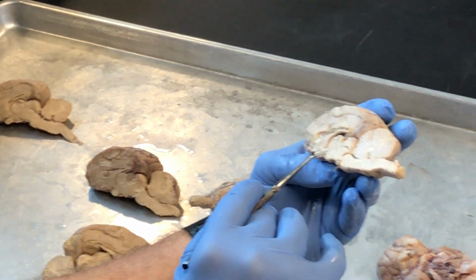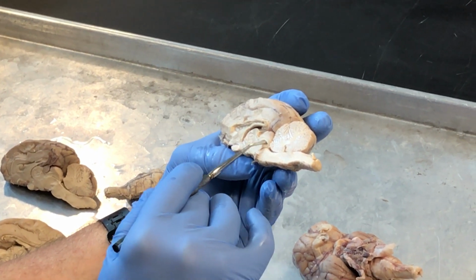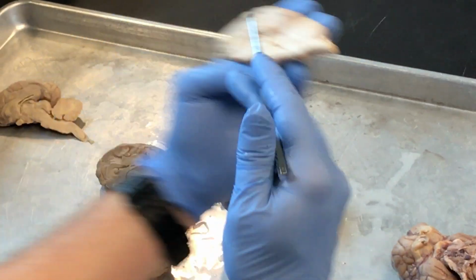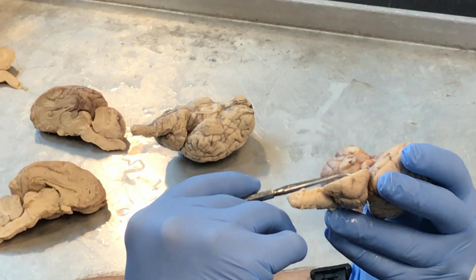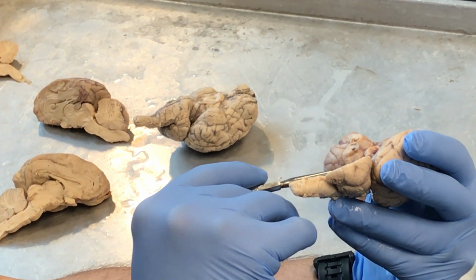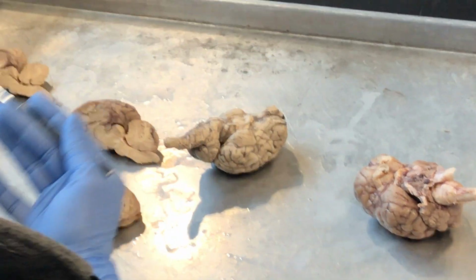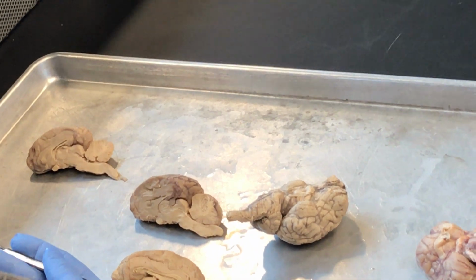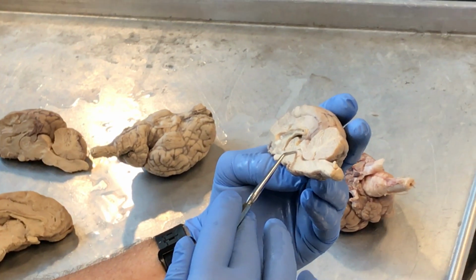It doesn't show the cut, but there's a little groove. You can see it right here. See that little groove right there? Going from basically the thalamus, third ventricle, it goes up like this and goes all the way back. This is the cerebral aqueduct, or the mesencephalic aqueduct, or the aqueduct of Sylvius. We'll talk about that in the lecture. All right? There it is.